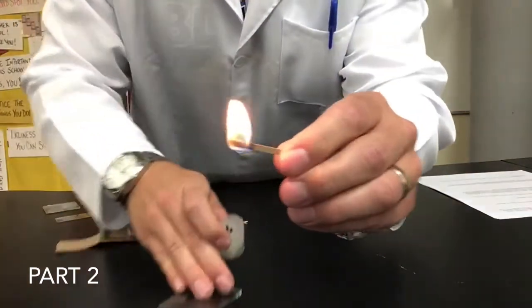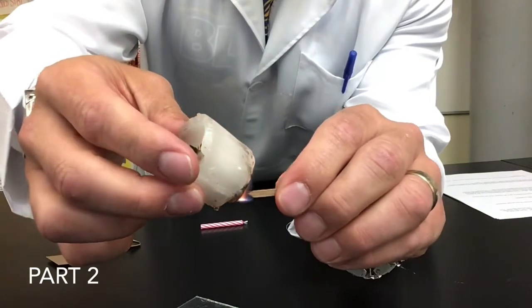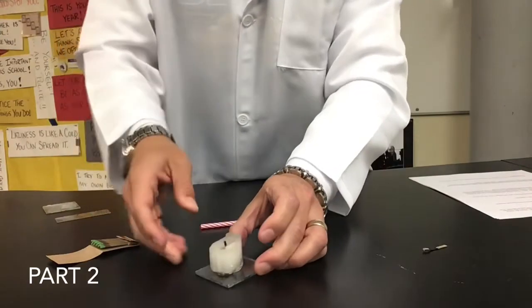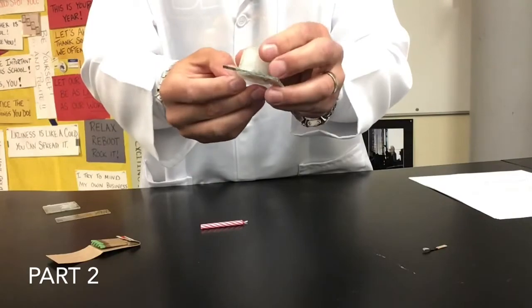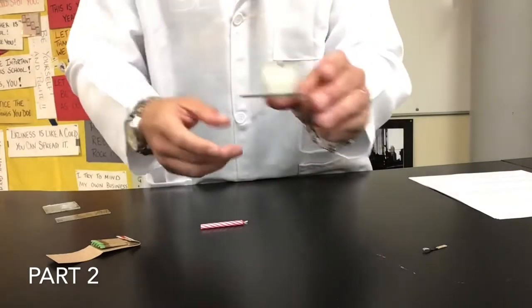What I'm going to do here is I'm going to light and melt the bottom of the candle a little bit. And then I'm going to stick it on to this glass square, all right? What that is going to do is, now that that wax melted a little bit and then stuck on there and hardened, now I have my candle stuck to the glass square so that it's easier to use and move around.